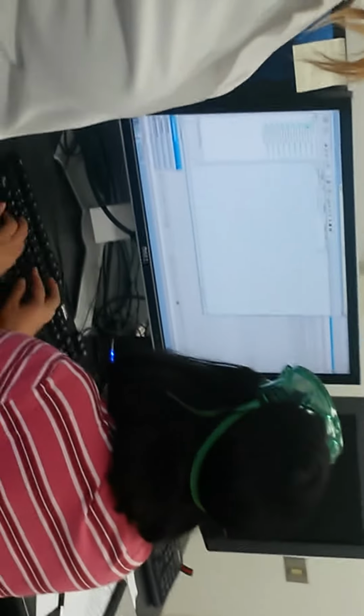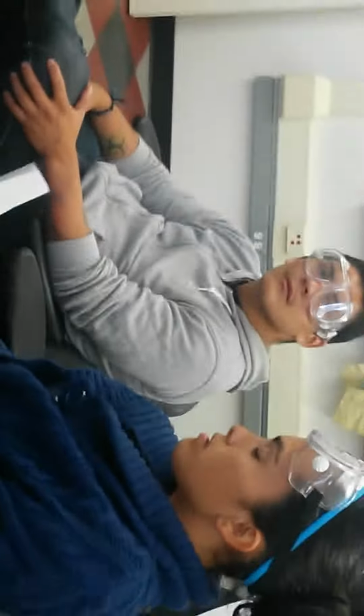So the idea, like I said, there are lots of different ways of doing this, but the idea is to have you guys just load up all your samples as a class and just come back when it's ready. Or if you want, you can come in, load up the method, do the sequencing yourself, then scan your samples, collect the data, and then log off. Done.